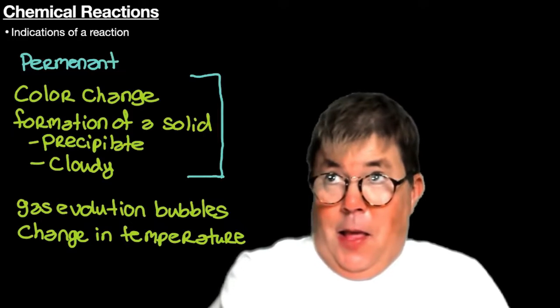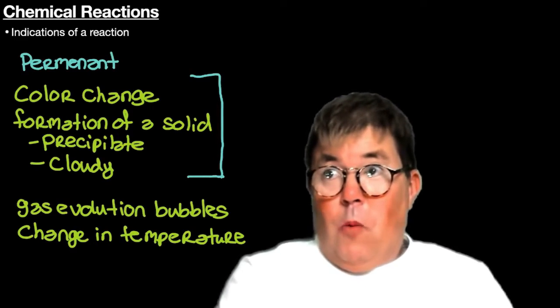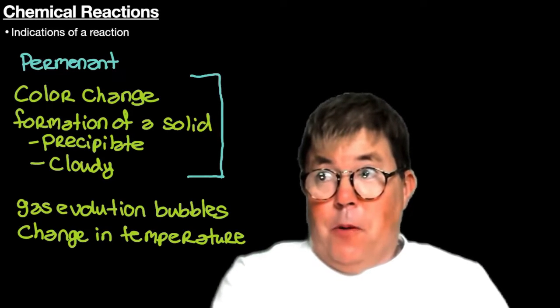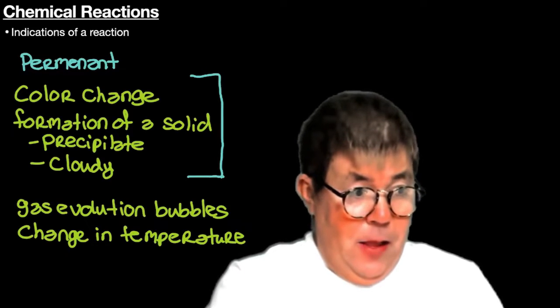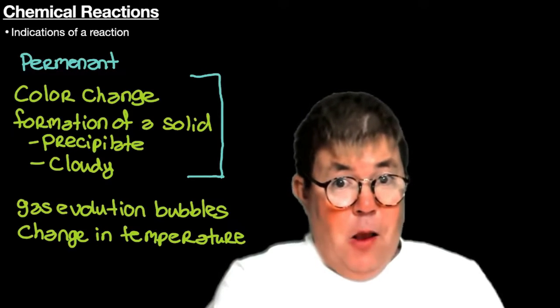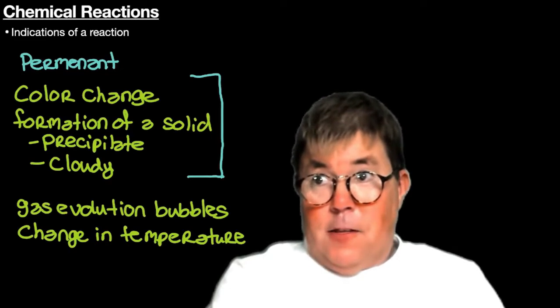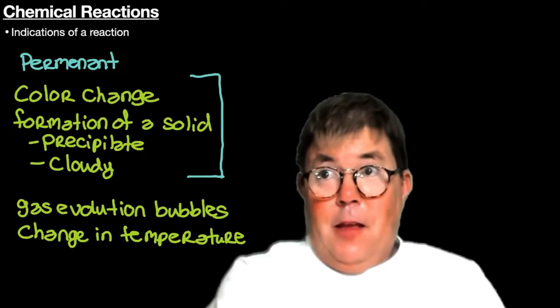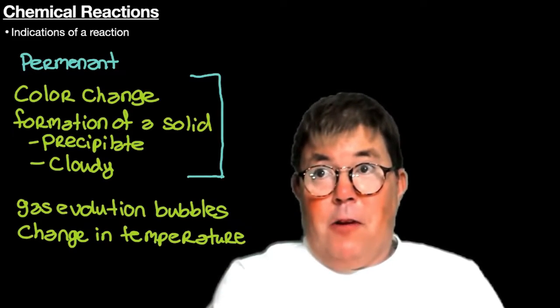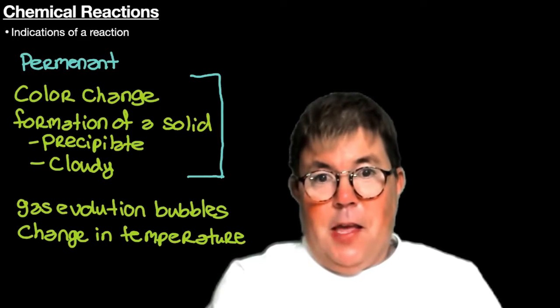Meaning, whenever mixing two chemicals, we may see a slight perturbation or disturbance, but after everything settles and reacts, we will see a permanent color change or a solid that is permanently there. Yes, maybe we see a little bit of cloudiness during mixing, but that is not an indication of a chemical reaction.